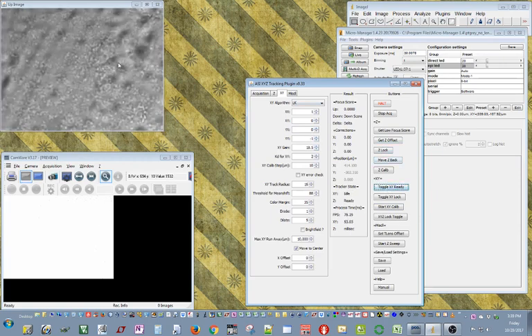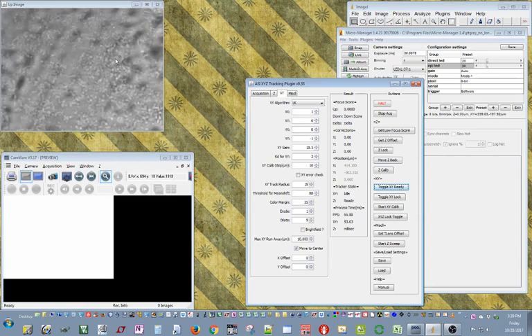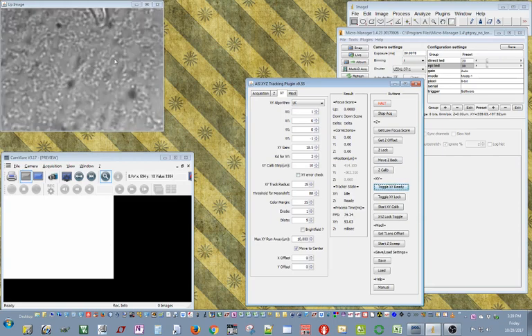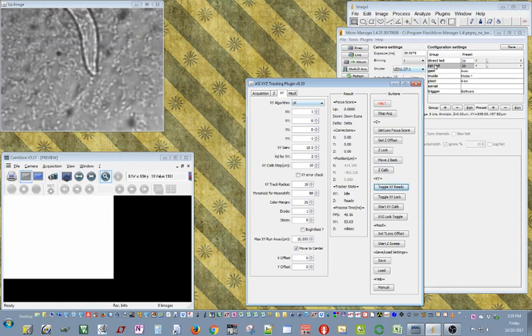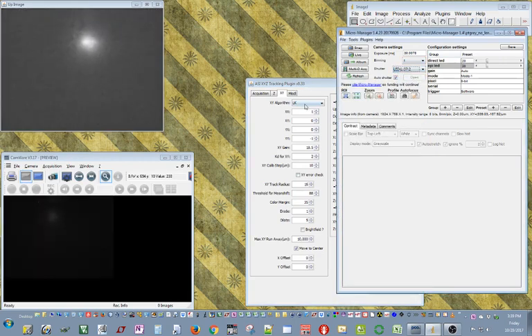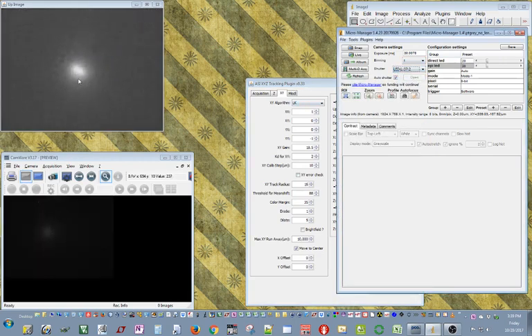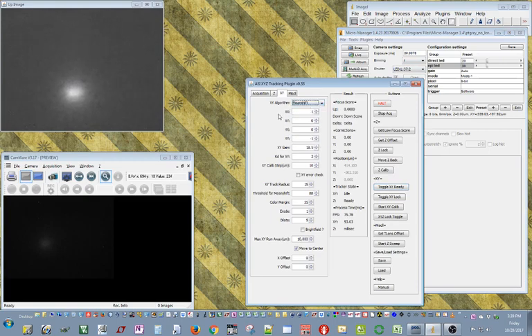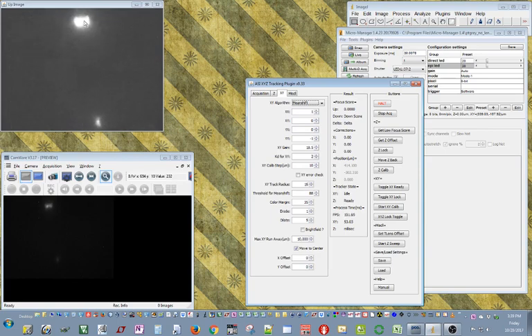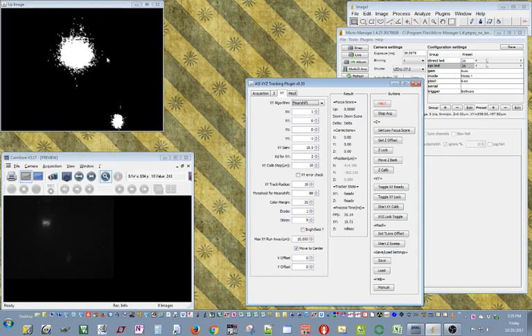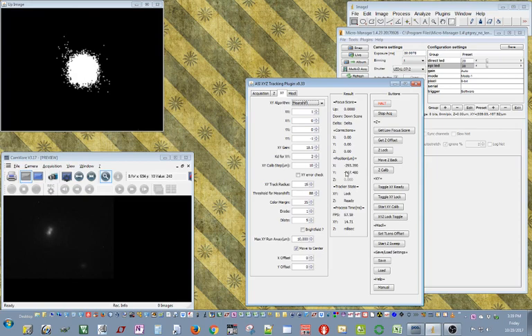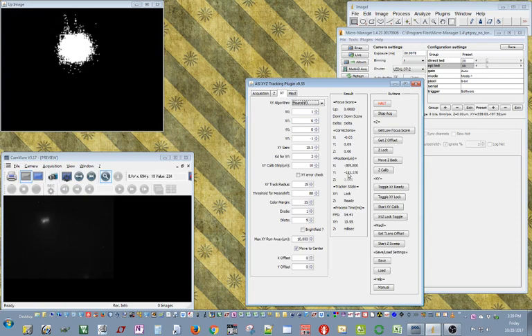Good. I'm going to clear it up now. And now I'm ready to find my worms. Let's see. Oh, found one. I'm going to quickly put it in epi illumination. There we go. And I'm not going to use LK, I'm going to use mean shift. I'm going to quickly try and see if you can lock onto that. And now lock. Now we are following the worm. That's it.